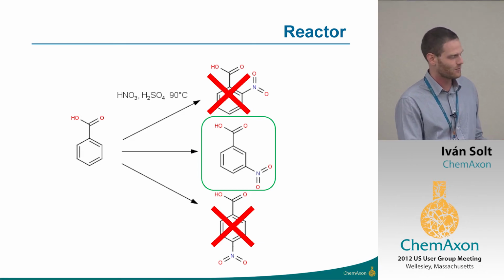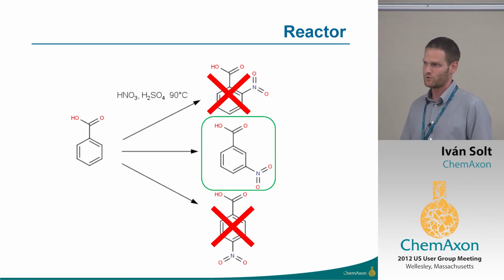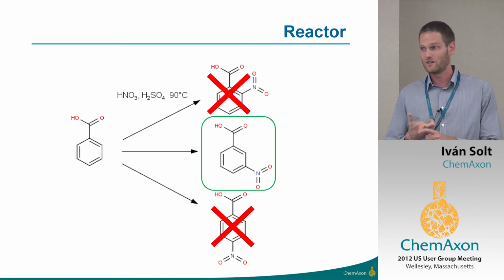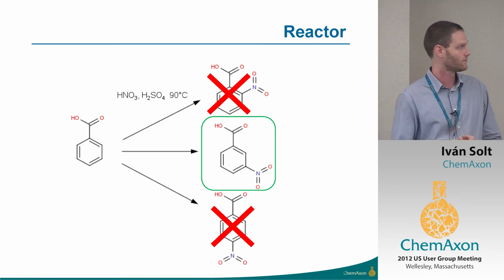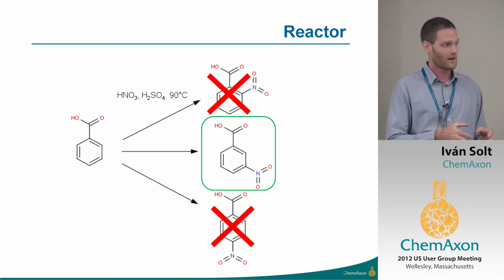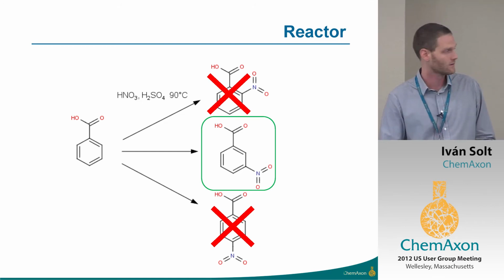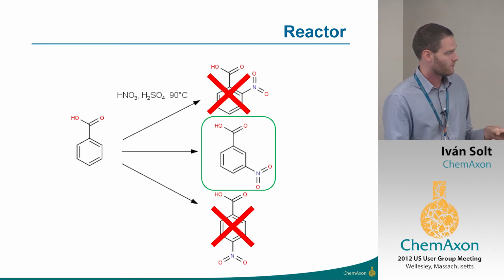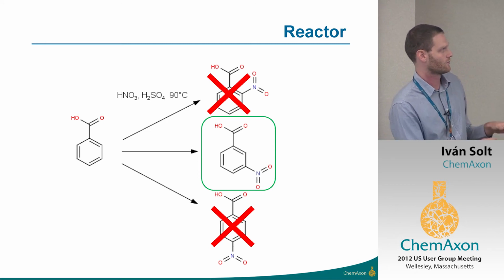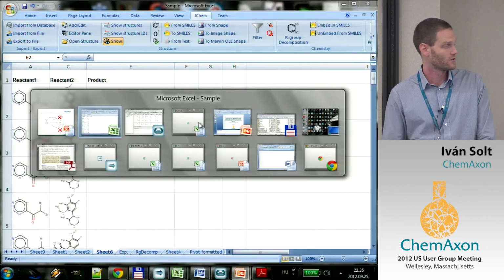A reaction scheme consists of a very generic reaction equation and a set of rules that determine the reactivity of the input reactants, the selectivity of the reaction itself, and it also takes care of the exclusion of those reactants which, under the given reaction condition, would undergo, for instance, alternative reaction pathways. Therefore, it is capable of predicting the synthetically available products from a set of input reactants. I hope this image tells you everything.